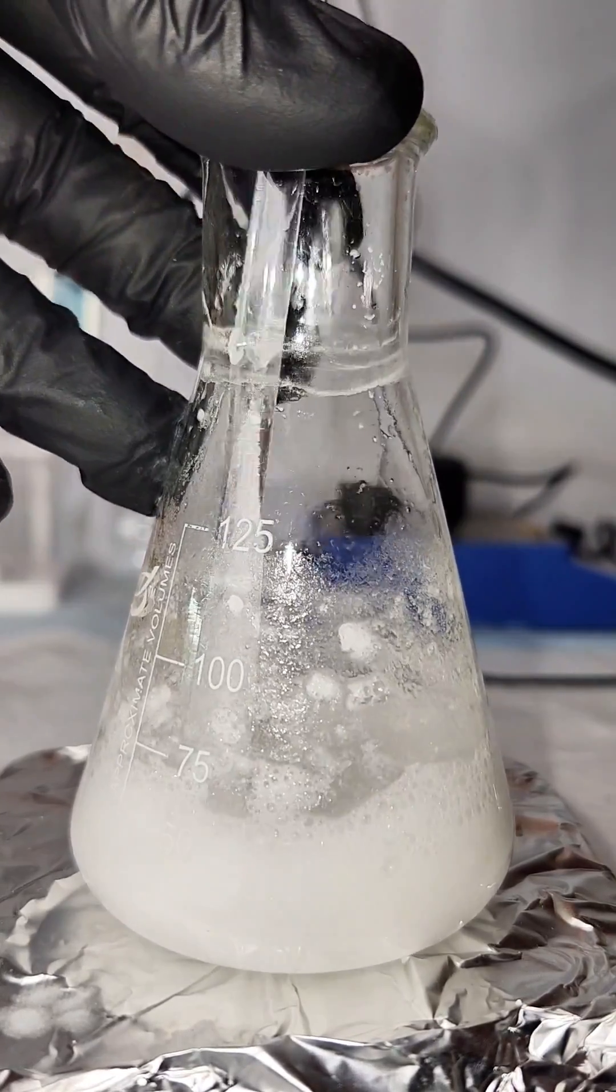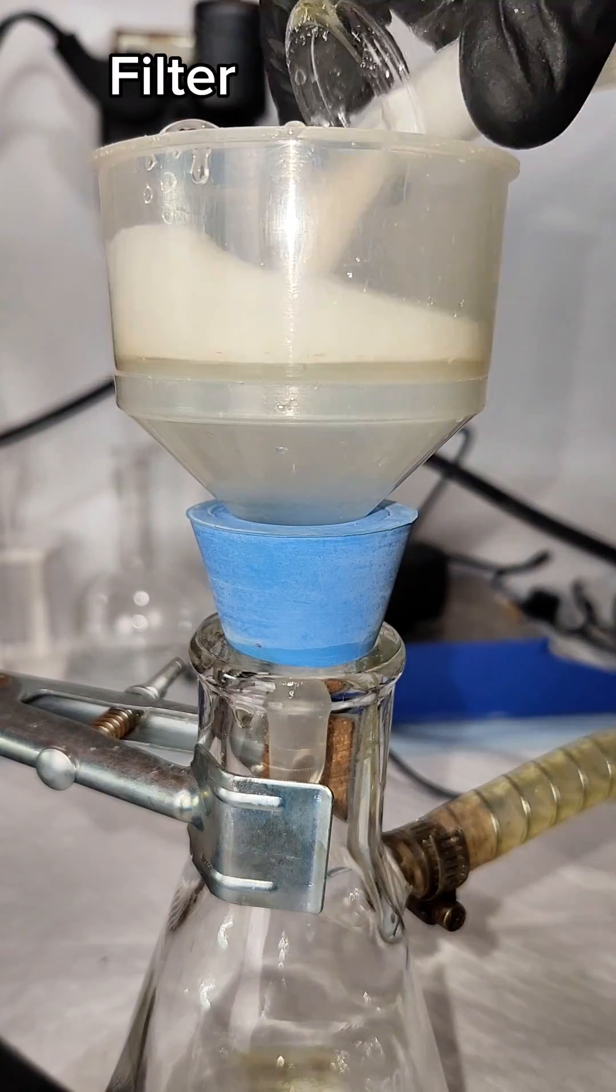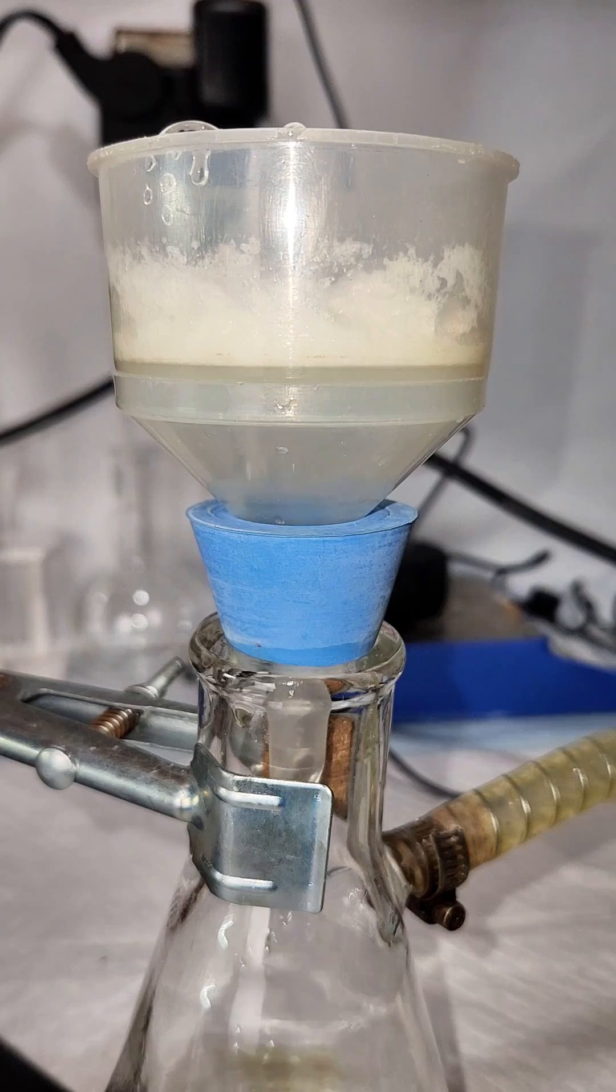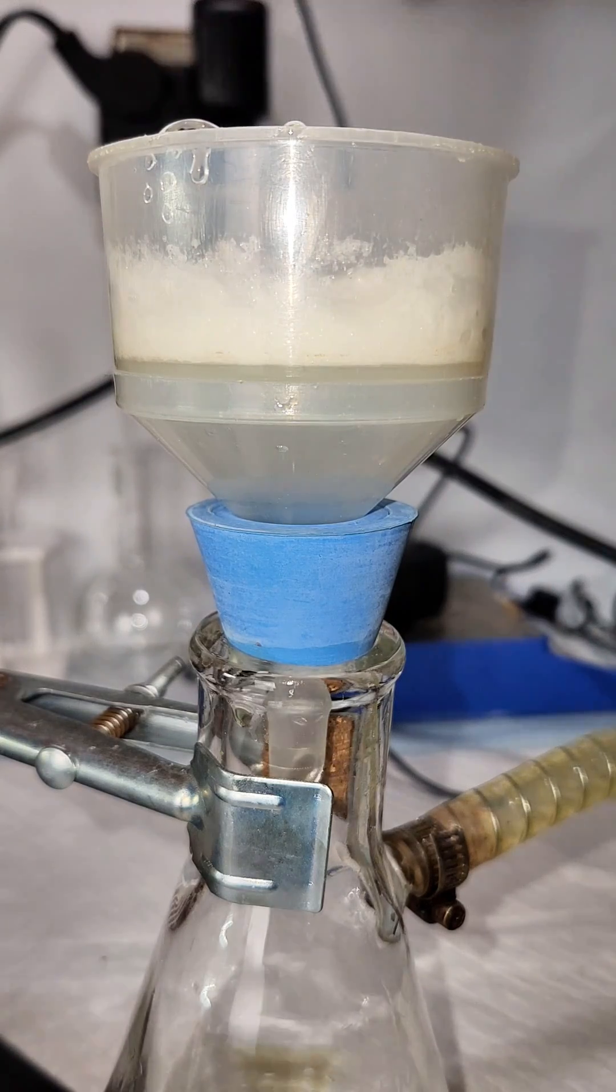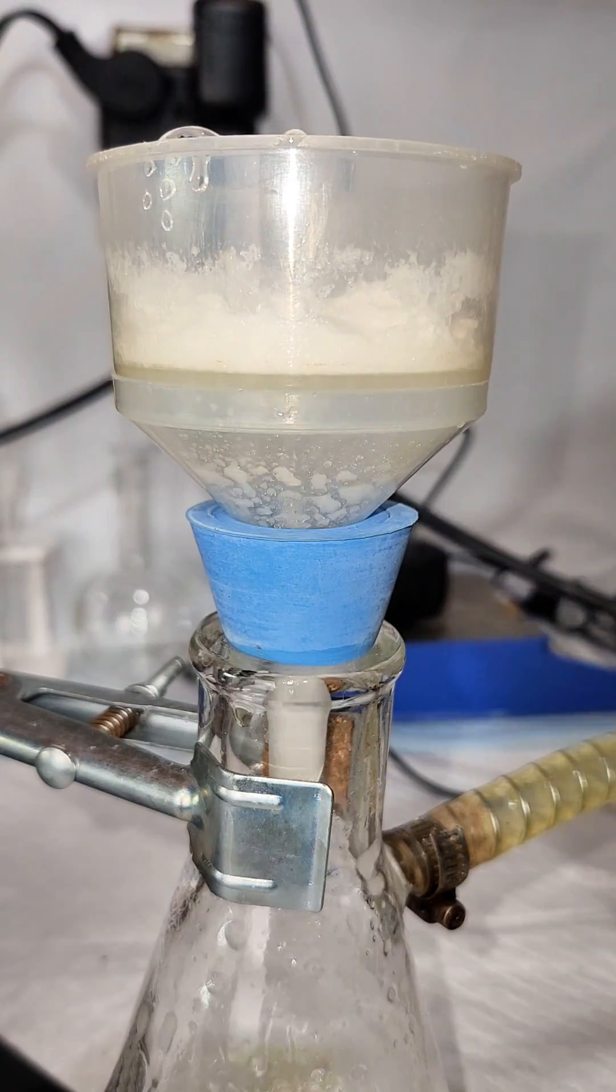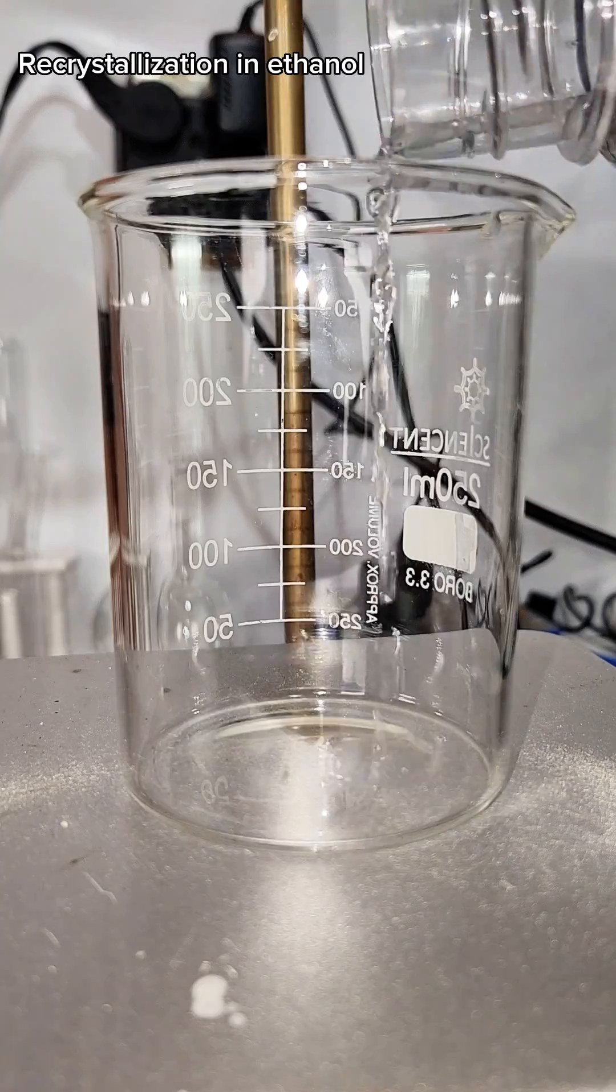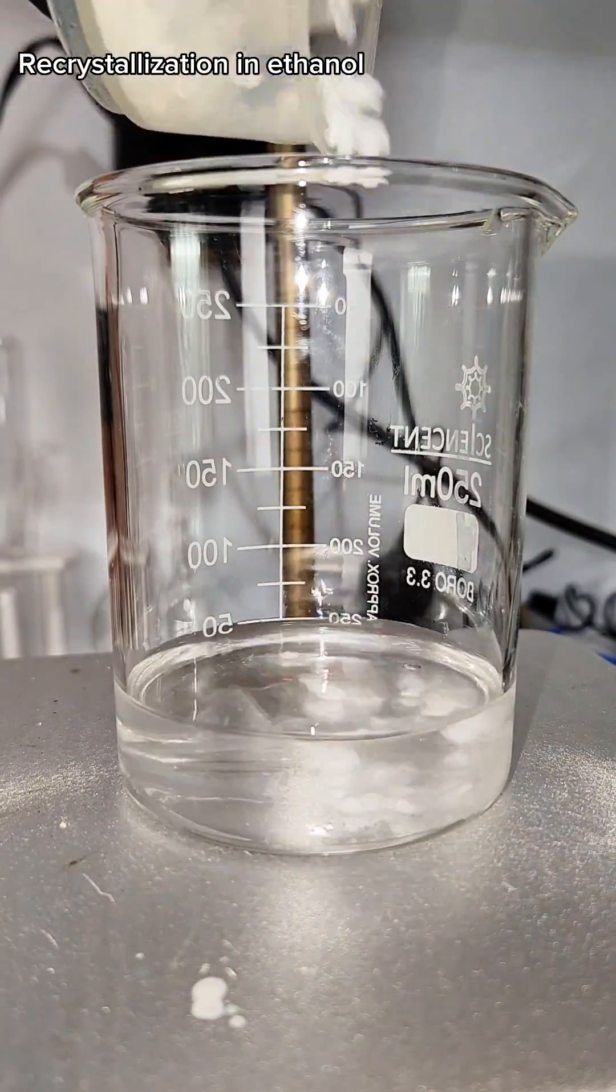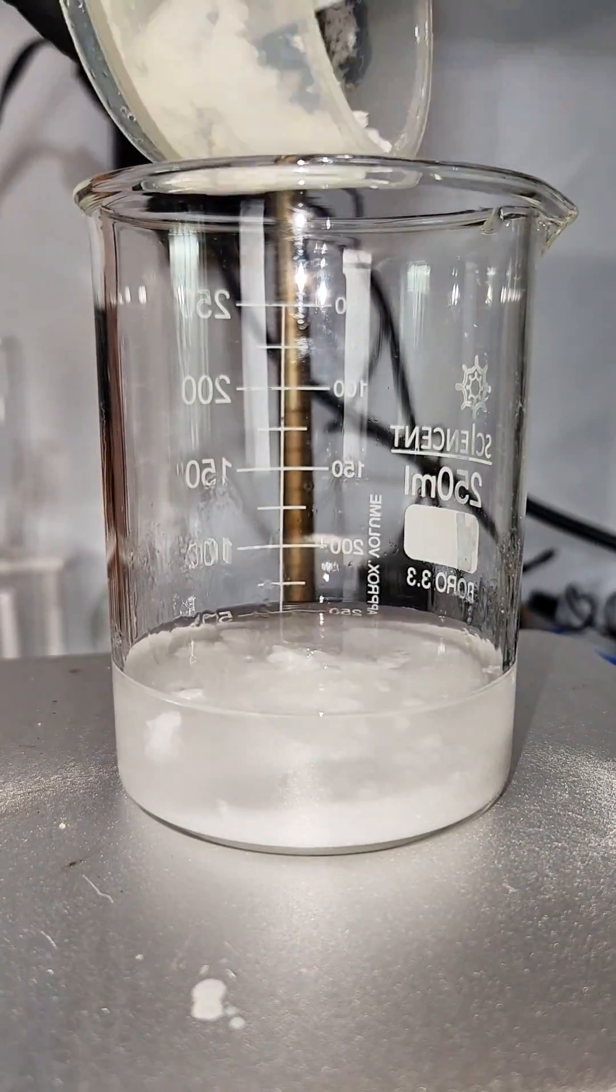I used a small excess of urea to make sure that all the phthalic anhydride reacted to phthalamide, which means I'm going to have a slight urea contamination here. Urea is extremely soluble in water, so a water rinse should be fine, but I want pretty crystals, so I'm going to do a recrystallization in ethanol.